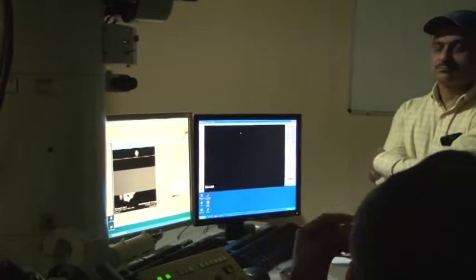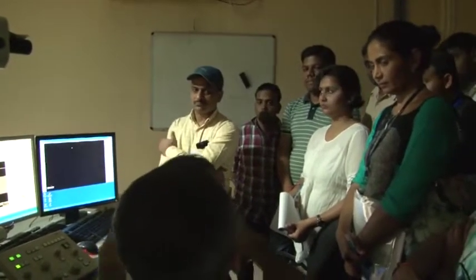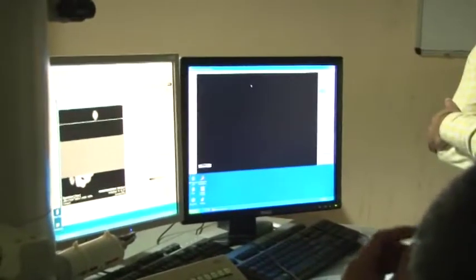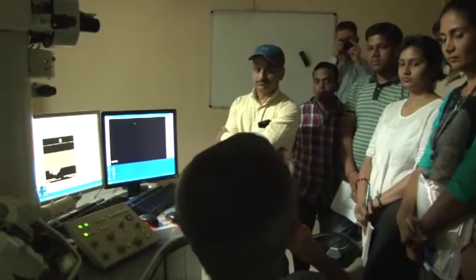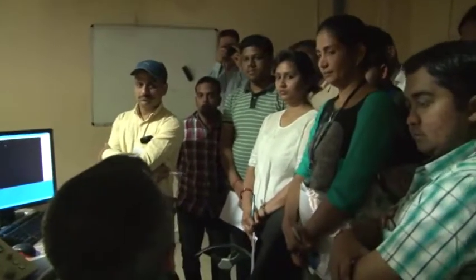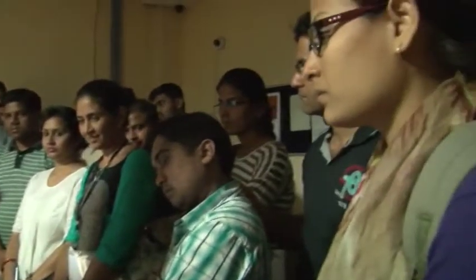You will learn eventually about diffraction patterns, zone axis, and how to tilt from one zone axis to another zone axis. So this is how it is done. If we have a silicon single crystal, with the diamond cubic structure, and you let the electron beam fall along 100, and now you want to change it to 110, how to change that? This is how you do it mechanically. But you still need to orient it. Just tilting in one direction, you may end up anywhere, isn't it?